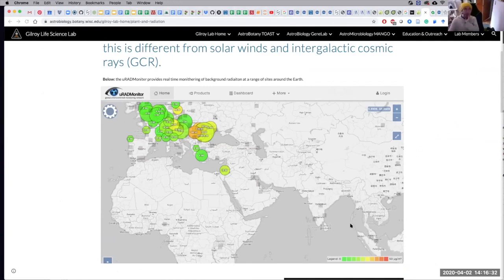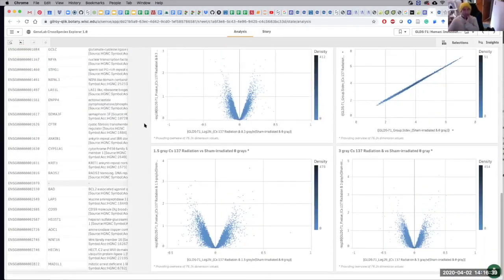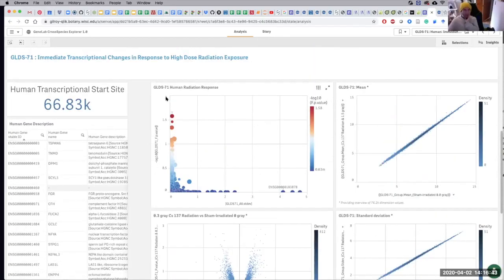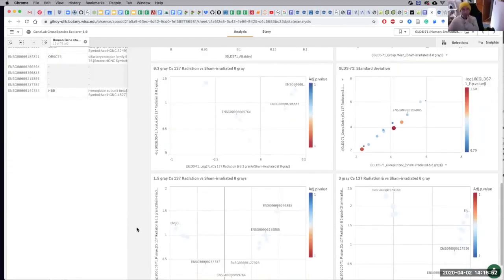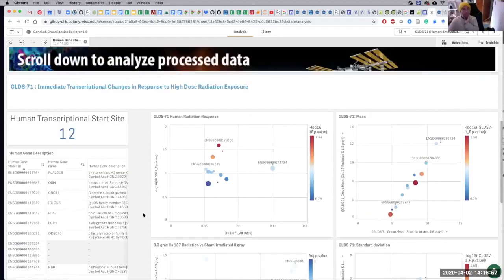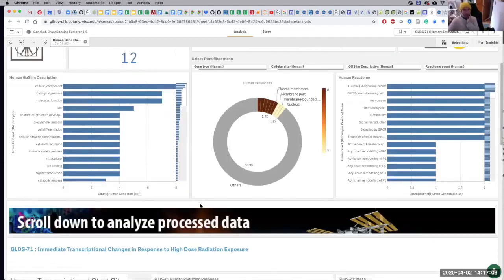These bloody people, as you go into the radiation stuff, there's so many different ways of measuring radiation intensity, it's annoying as hell. But anyway, again, we can do that classic thing where we can select the most variable, most significant genes, or the most variable, and go to significant. And so this is taken from all of these combined here. So it's a bit noisy, right? But it'll do. So these genes might be really interesting. They might be involved in the human response to radiation.